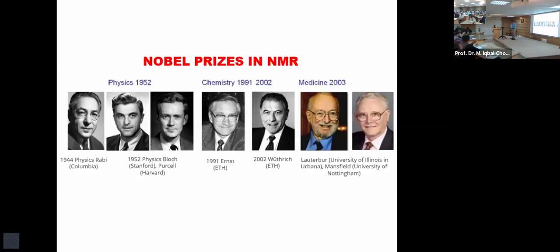You've seen ethanol. How many signals? Because how many protons? Right? A protein generally has 3,000, 4,000, 7,000 protons. And if you see 5,000 protons in the NMR spectrum, you can only go and take a coffee and samosa. Nothing else you can do.